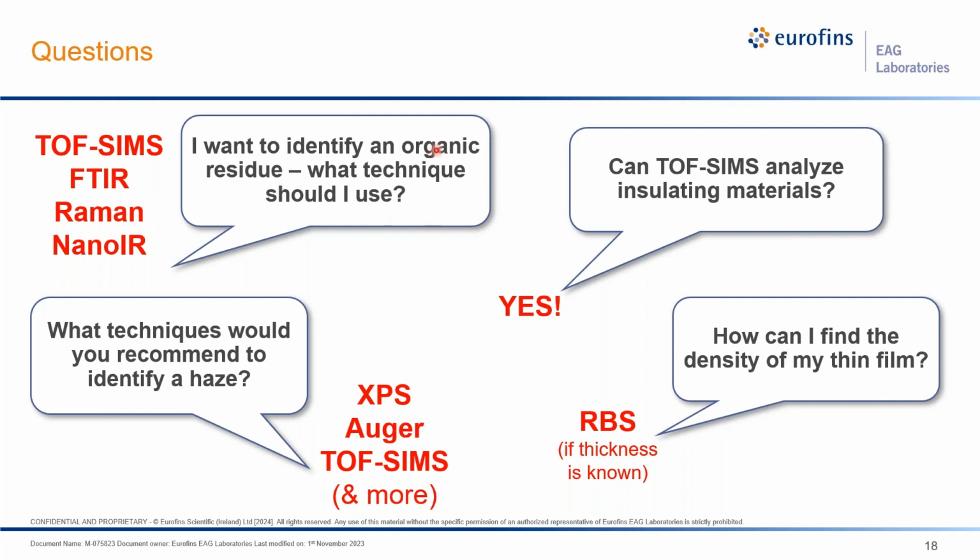But when we come back to this idea of an organic residue and what technique should be used, yes, time-of-flight SIMS is wonderful for very thin residues, trace level species. If the residue is thicker or there is perhaps more of it present, FTIR is wonderful, so is Raman, so is nano IR. And these techniques will all be explained to you by our next presenter, my colleague, Dr.